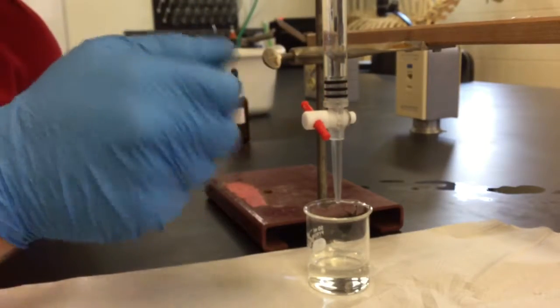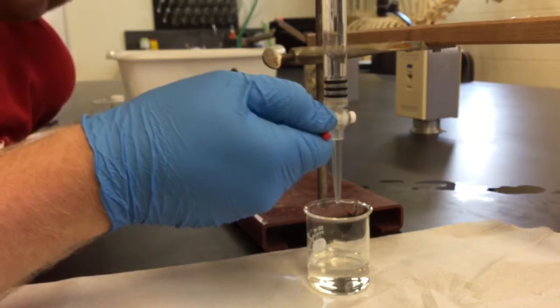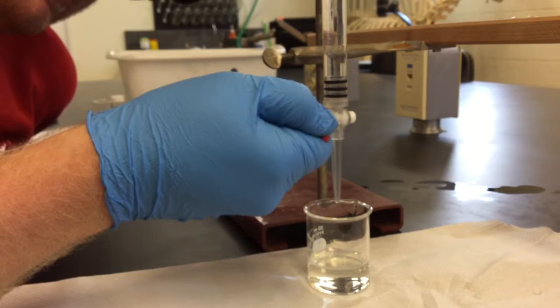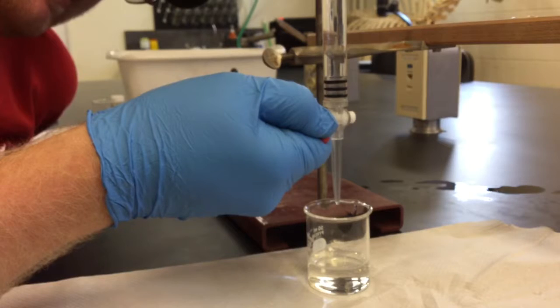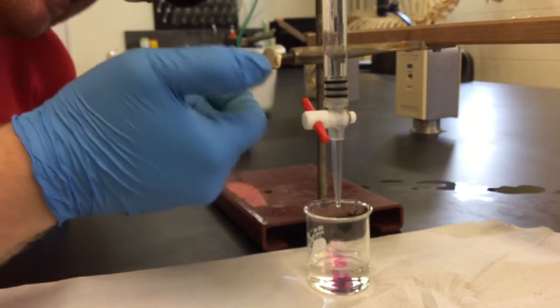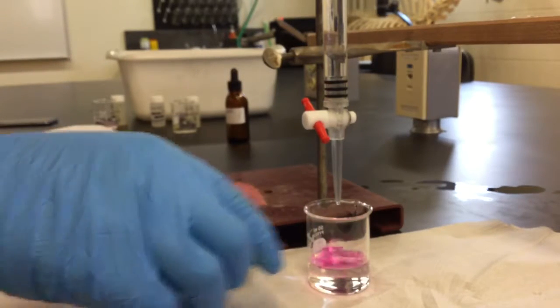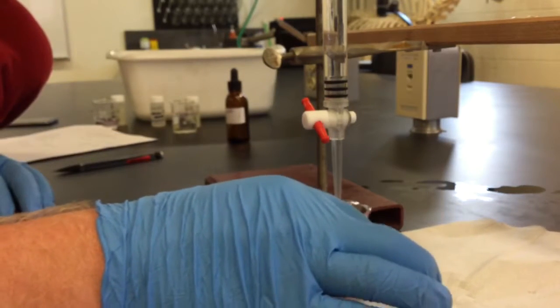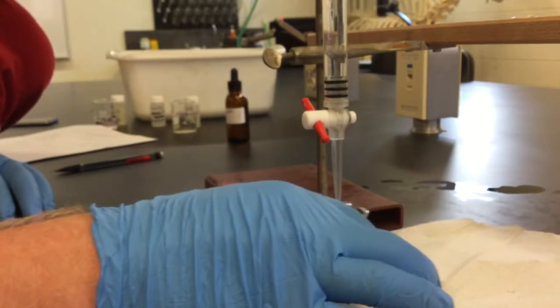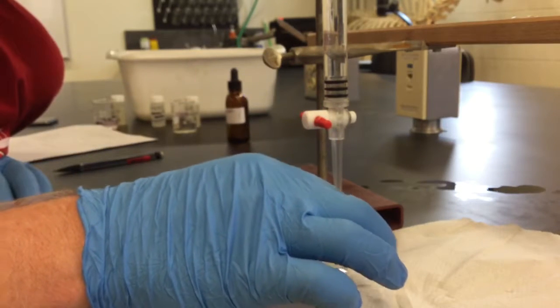The next step is to open the burette so that it slowly adds sodium hydroxide drop-by-drop. You can see that it's adding drop-by-drop and causing a pink color. I'll swirl the jar, which will cause that pink color to go away, so let me shut this off real quick.